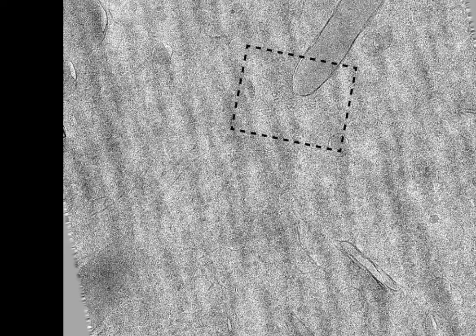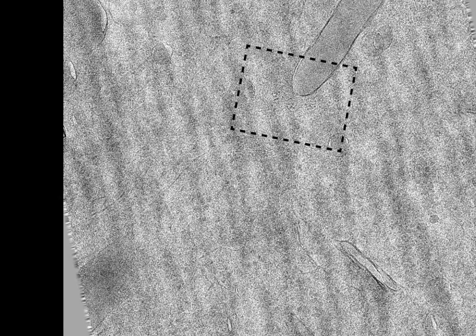After tomographic reconstruction, we focused on the structures visible at the leading edge of the septal membrane. In this tomographic slice of a transverse section through the actomyosin ring, you can see a bundle of 7.5 nanometer wide densities corresponding to cross sections through actin filaments. You can also see the leading edge of the ingressing cell wall and the membrane at the front edge.